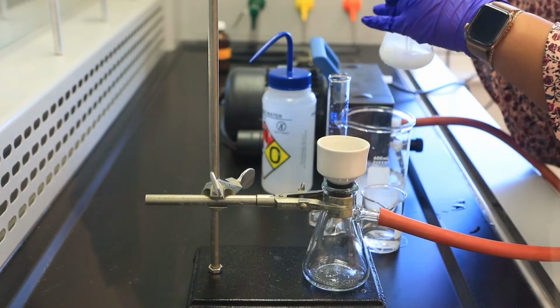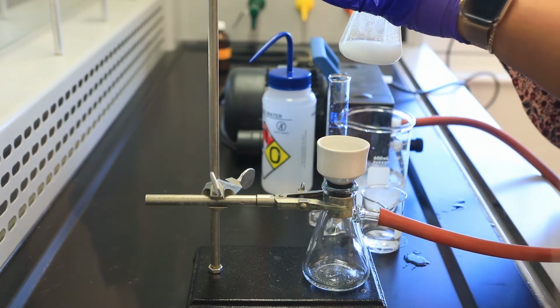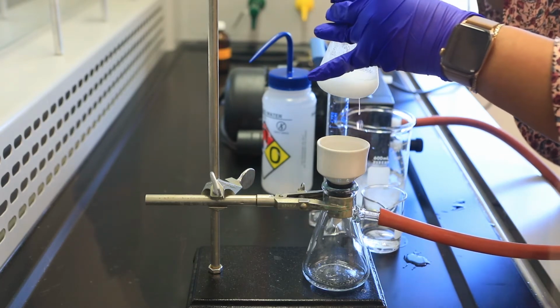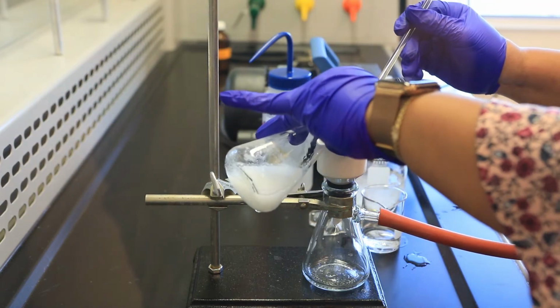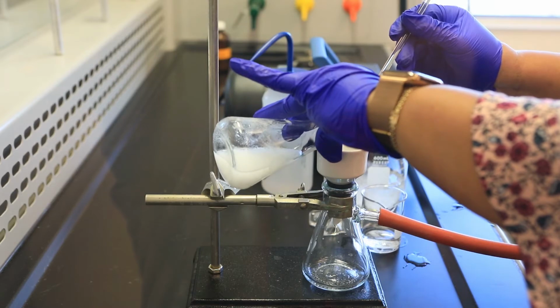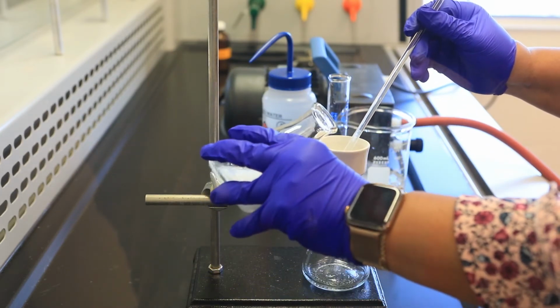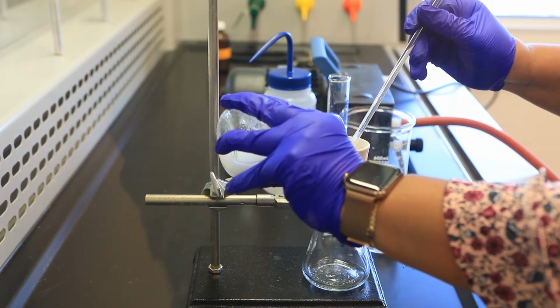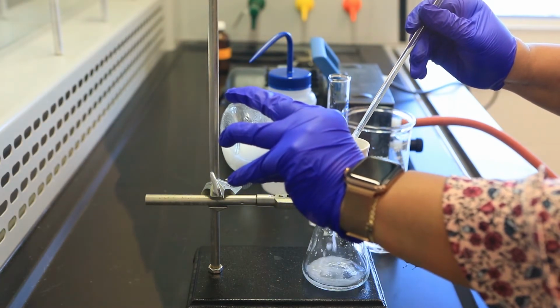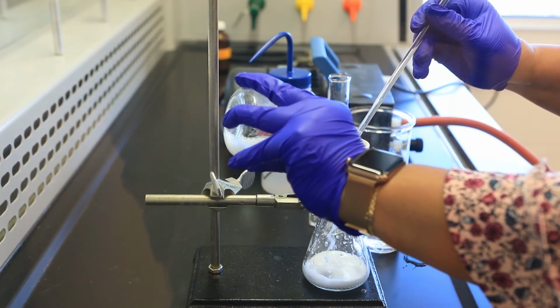I'm going to go ahead now, and by means of vacuum filtration, collect our beautiful crystals. Using a stirring rod, I'm going to transfer our reaction mixture to the Büchner funnel.